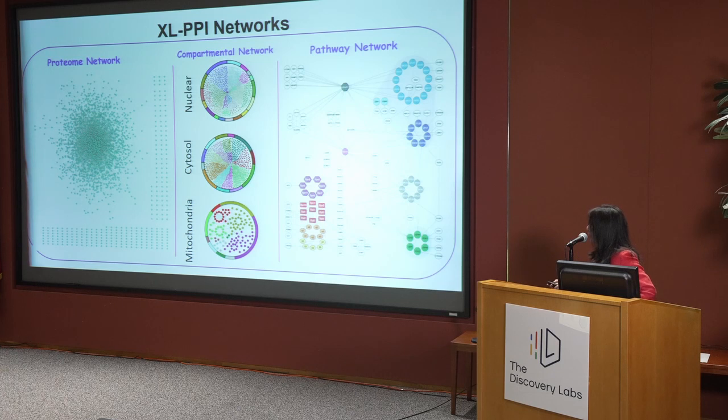So with the cross-linking information, we can derive the experimentally determined interaction network as shown here. These are a couple thousand interactions among 2,500 nodes, and every edge is determined by cross-linked peptides.